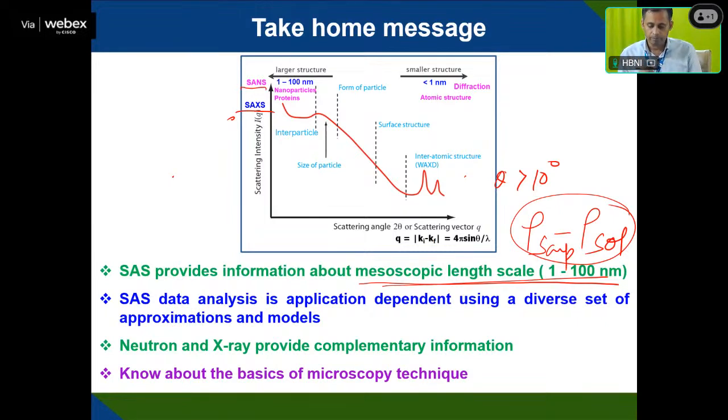And then you have a model to fit, and depending upon the q to the power 0, q to the minus 1, minus 2, you can get the shape information, as well as the size. Using the P(Q) S(Q) form, you can get the shape, size, as well as dynamic structure from there.